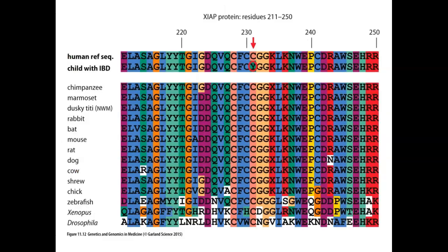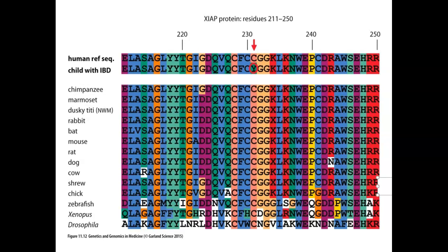So once we get all this information, it's just one example of a particular bioinformatic tool that we could use to analyze the results. In this case it would have been DNA, and if we use something like a cDNA, which is going to be only the particular nucleotides involved in protein synthesis, then even though originally what we sequenced was the DNA, we can figure out exactly what the amino acid would be as well if we use, for example, a cDNA from mRNA.